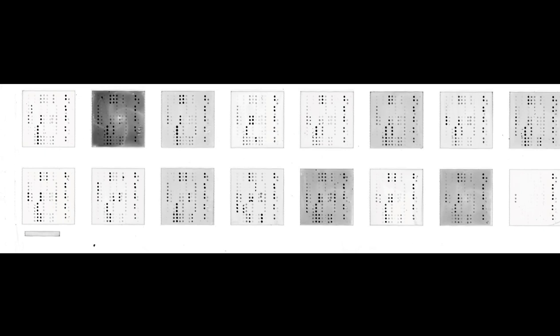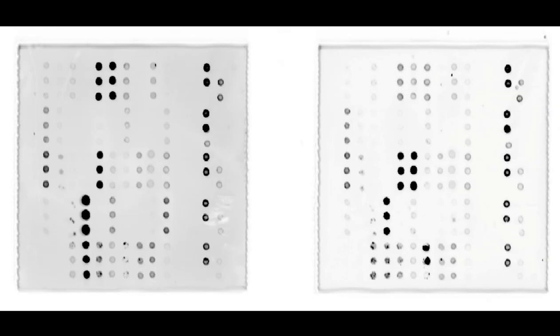And now is the question, is the resolution here high enough for quantification? Protein microarrays, of course, we want to look at the densitometric analysis. So let's zoom here on 2 of these squares. You see here. And, well, the resolution is more than enough. So there are enough pixels per protein spot for quantification.